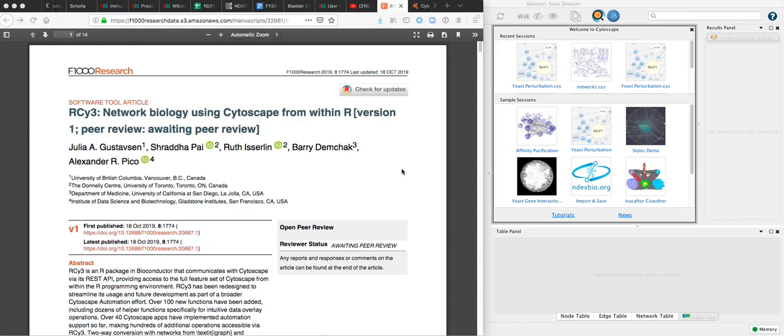This is Cytoscape 3.7.2. We're going to look at an RCy3 use case from the F1000 research paper.